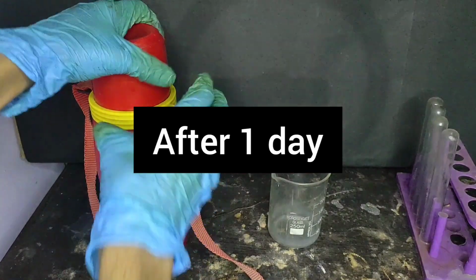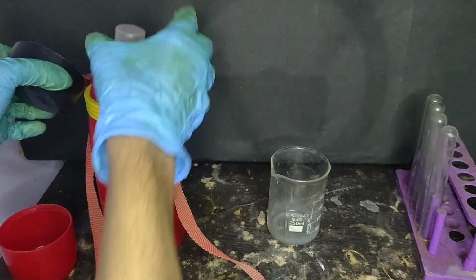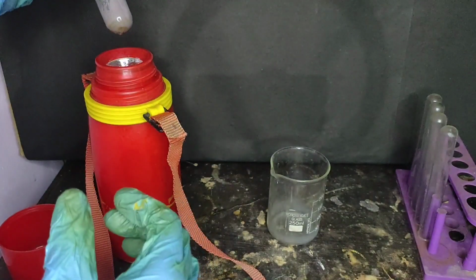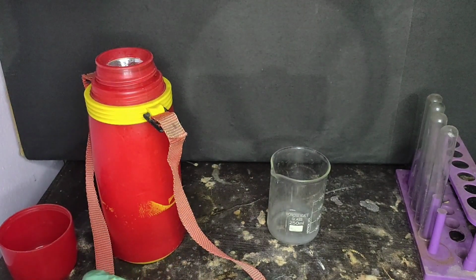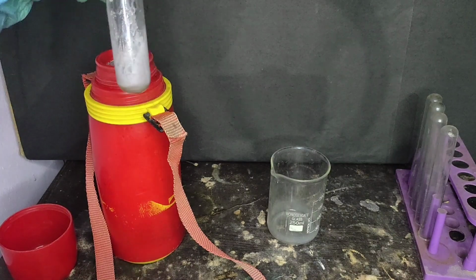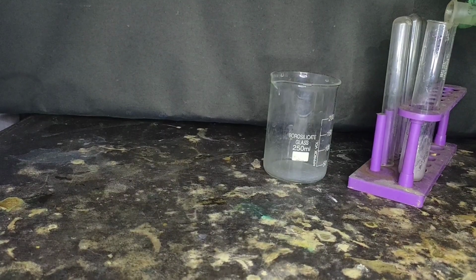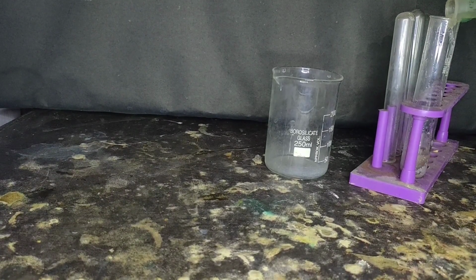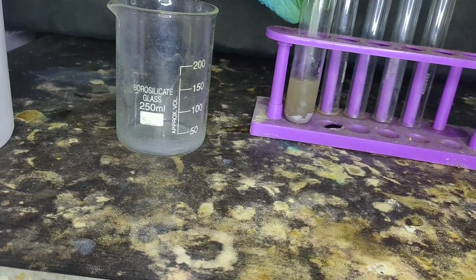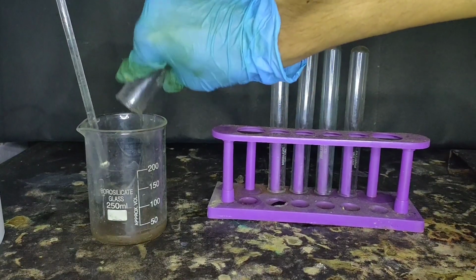I kept it in the thermos flask for 1 day, and after 1 day I took out the boiling tube, and it seems that the reaction has occurred. Now, I will take out the contents. To the boiling tube, I will add 10 ml of distilled water to dissolve the naphthalene sulfonic acid. It is stirred with a glass rod, and then all the contents are transferred into a beaker.